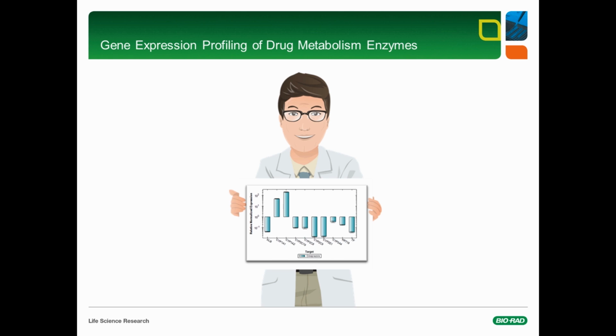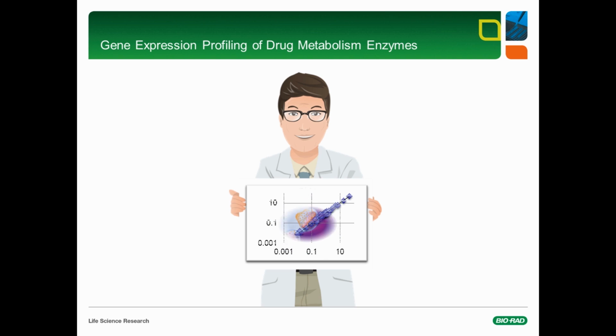In addition, we evaluated the dose response across a 4,166-fold concentration range. Furthermore, we demonstrate the data concordance between a one-step approach and a two-step approach to emphasize the value of using one-step without compromising data quality.